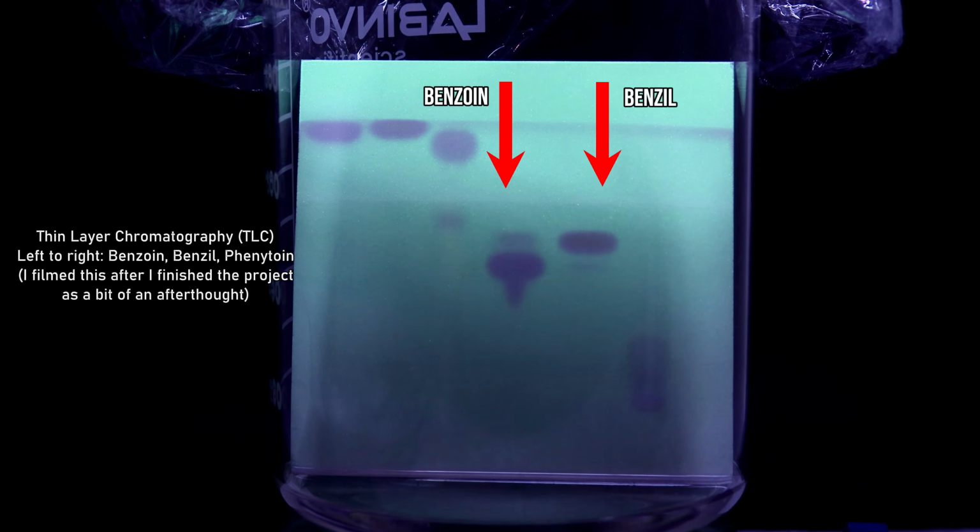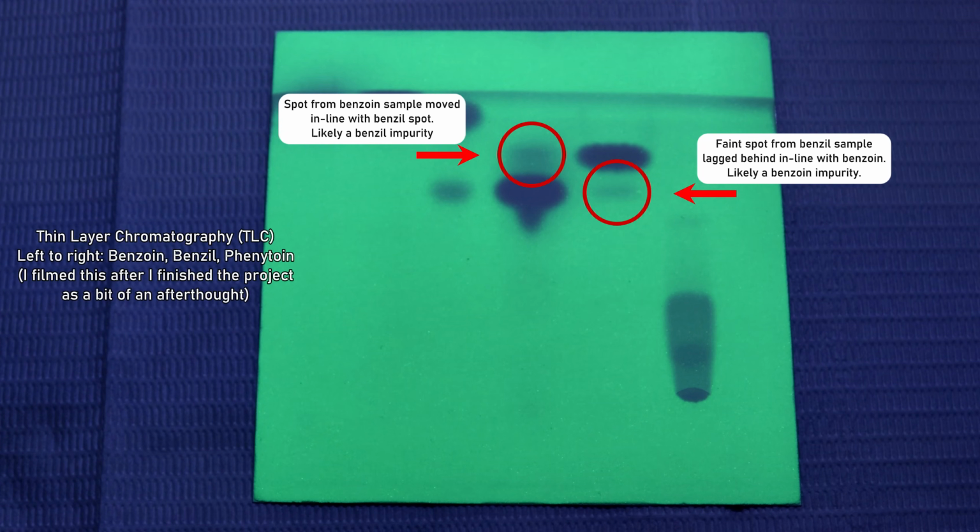As you can see, the separation is pretty good, but a tiny amount of my Benzil sample did move up in line with the Benzoin. This indicates that while my Benzil is mostly pure, there is a definite noticeable impurity of benzoin.